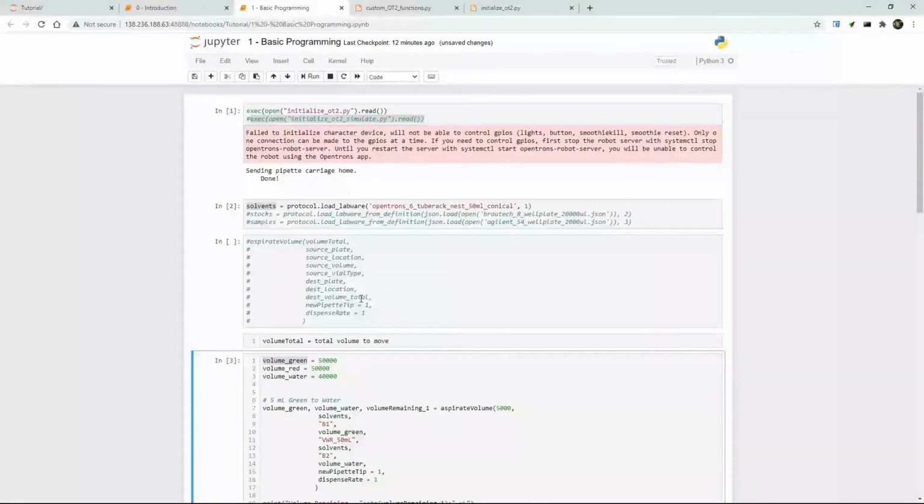So with that said, it looks like it's going to be the end for this chapter. I don't know what the next chapter is going to be yet. Probably going to start going into the intermediate level topics, going into detail about the functions, what's actually going on here.